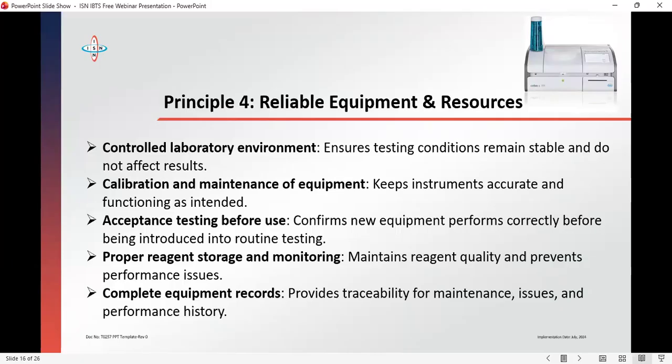Proper reagent storage. We are running a lab and NEPA takes light. Your fridges are not on any kind of inverter. The cold chain, freeze and thaw of those reagents. And mind you, Nigeria is not a very cold country. We are hot. More often than not, we get 32, 38. And for cold reagents that are supposed to stay at 2 to 8, they also have an adverse effect with respect to how the fridge functions.